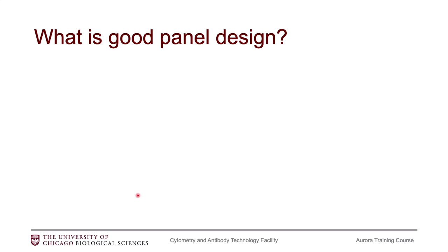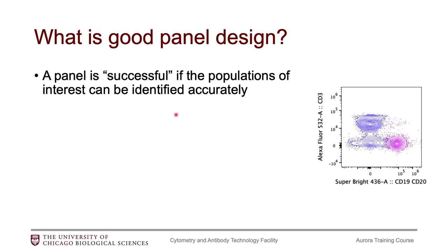So what exactly is a good panel or a successful panel? A panel is good if you can accurately identify all of the populations within your panel or all of the markers within your panel. I have an example here where we have B-cell markers on the x-axis and T-cell markers on the y-axis. I'm trying to remove the B-cells from my analysis. You can see for this B-cell marker I'm not able to cleanly resolve the B-cells from the not-B-cells because there is an issue with panel design, and we'll talk about later why exactly this is.